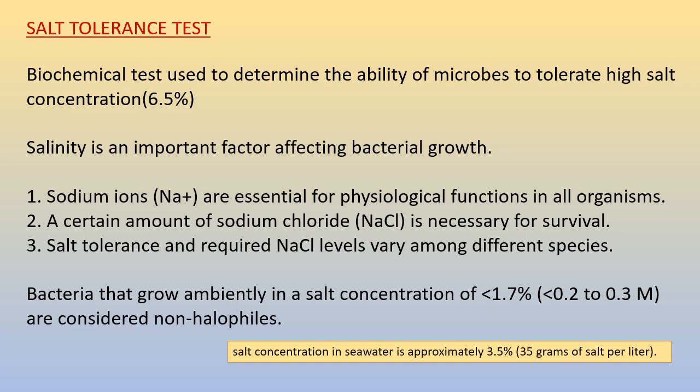It is a biochemical test, and it gives you information about up to what concentration your microbe is able to tolerate salt. It is used to determine the ability of microbes to tolerate high salt concentration, like say 6.5 to 7 or 8 maximum. You can go up to 8 for your lab level practical.